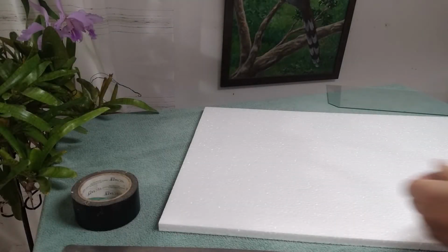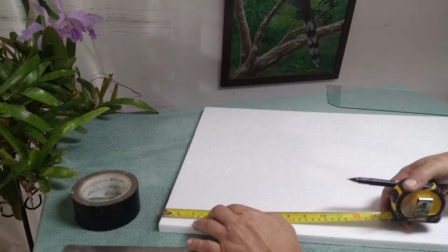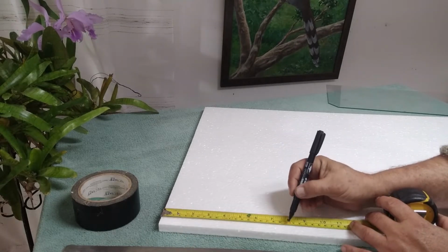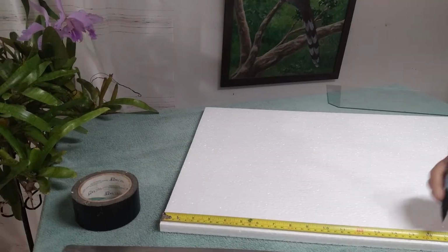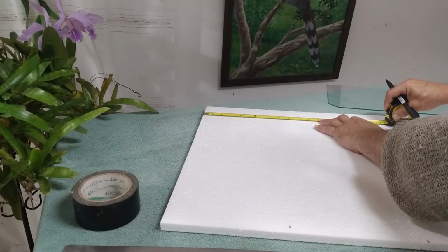Let's begin by building the box itself, which I made using styrene foam sheets, the kind you find in any stationery shop, and duct tape that you find in any hardware store too. We are going to use 10 mm thick styrofoam sheets. For the front side of the box, we're cutting two rectangles, 20 by 50 centimeters each.